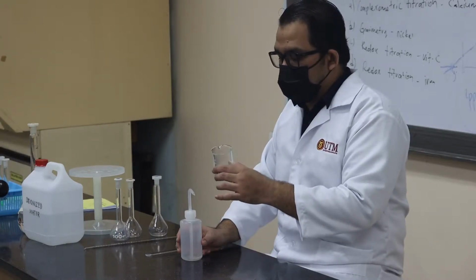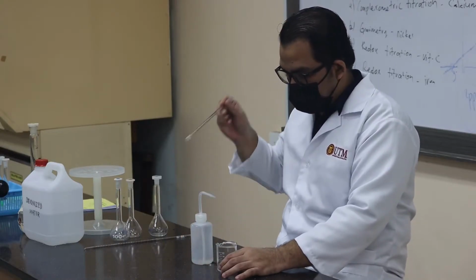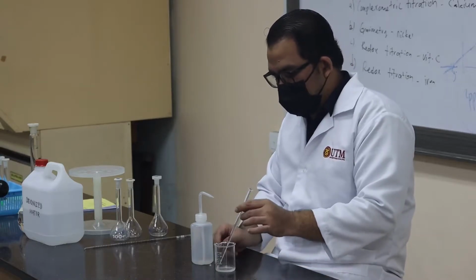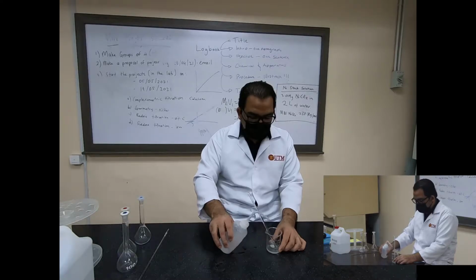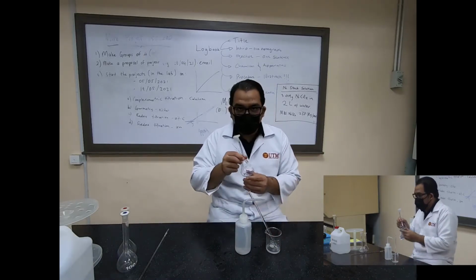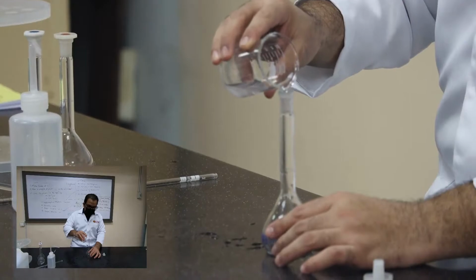The next step in this process is to prepare the solution. I am going to dissolve the 0.44 gram zinc sulfate in 100 milliliter of deionized water. Stir it to make sure that it is homogeneous. And then the next step, of course, after preparing this, I have to transfer into 100 milliliter volumetric flask. So now let us prepare this first. Okay, we stir, then get our volumetric flask. Then we can start transferring the solution into the 100 milliliter volumetric flask.